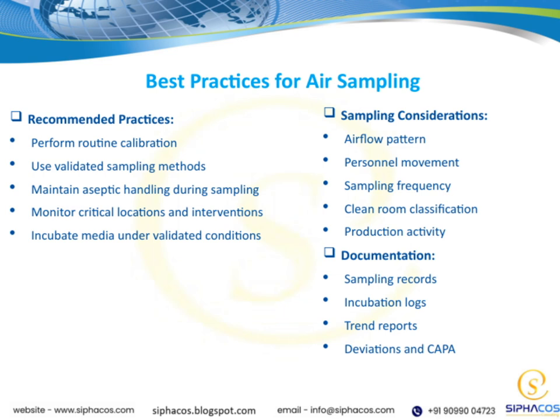Lastly, incubating media under validated conditions ensures that any microbial growth we observe is dependable and meaningful. All these points are interconnected. By applying these best practices, we uphold the integrity of our clean room environment and ensure product quality and safety.